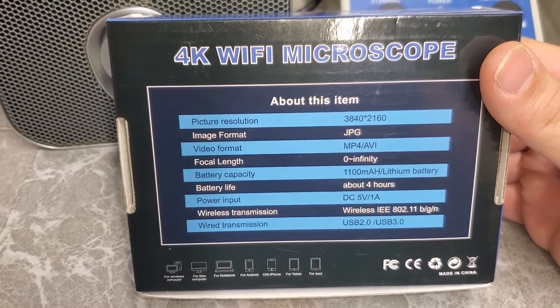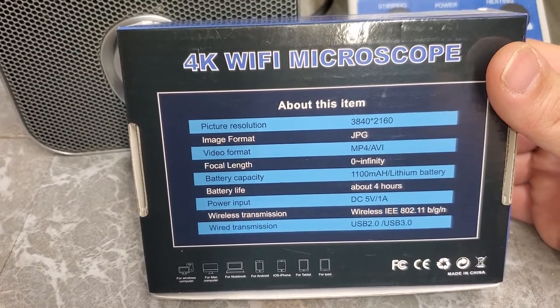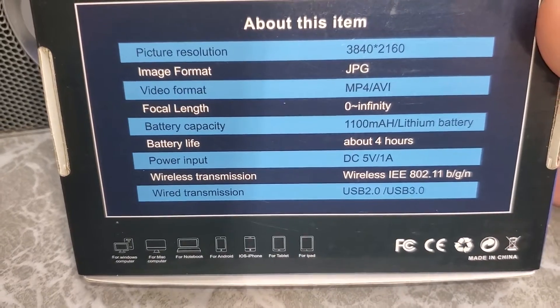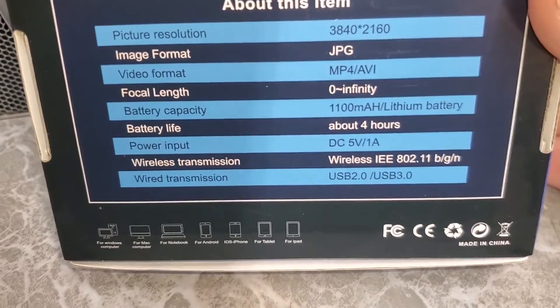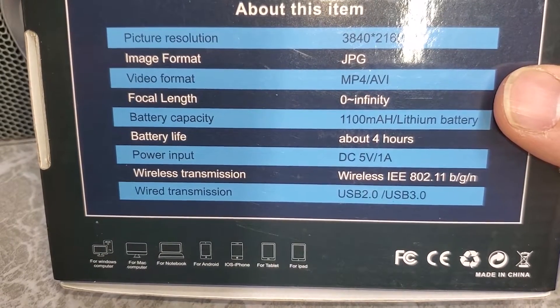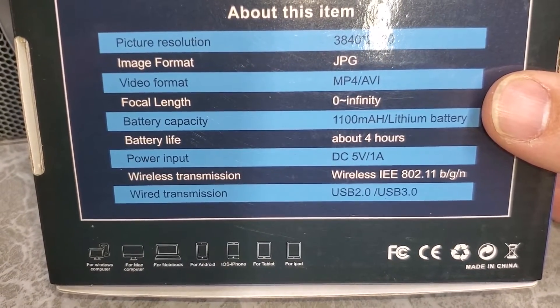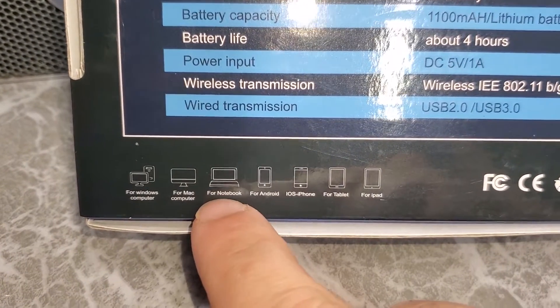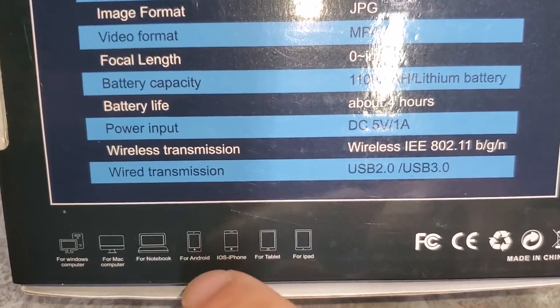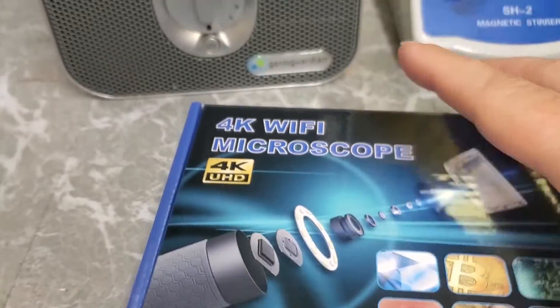On the back: picture resolution 3840 by 2160, images in JPEG format, video format MP4 or AVI, focal length zero to infinity. Battery capacity is 1100 milliamps — that's actually pretty good — with about 4 hours of battery life, which is about what I'd expect. It charges via USB at 5 volts, and uses regular Wi-Fi transmission. You can also connect it to a computer via USB cable. It works on Windows, Mac, Android, iPhone, tablets, and iPads.